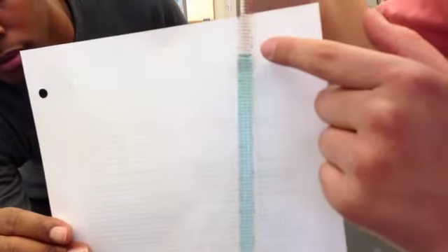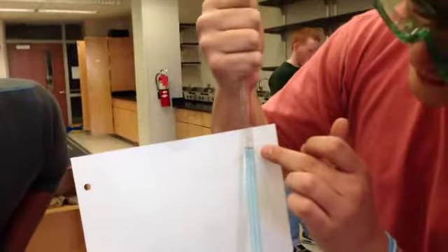So as you'll look, we're going to count at 3.5, that's 3.6, 3.7, and that's about 3.8. Now as you'll see that looks like it's a little bit under 3.8. That's because when dealing with these, you're also going to have an uncertain variable. And the uncertain variable is the hundredths place after 3.8. So it looks like it's a little bit under 3.8.